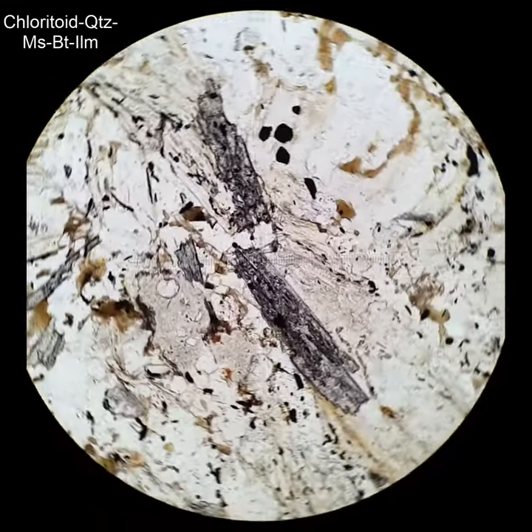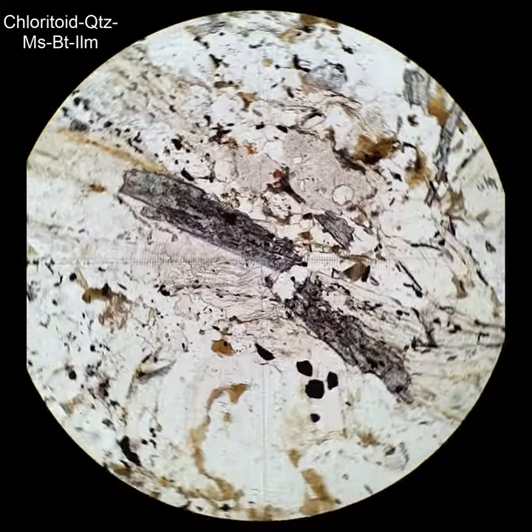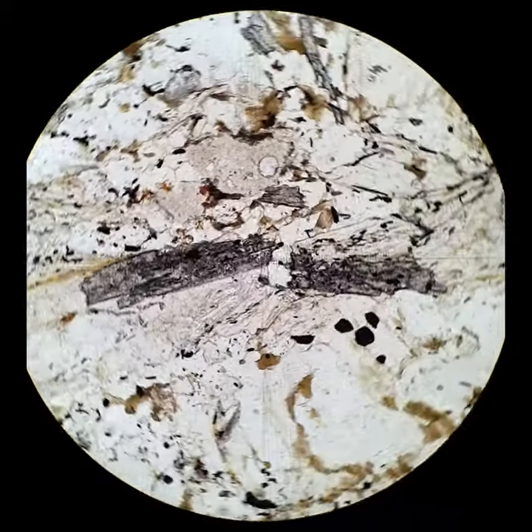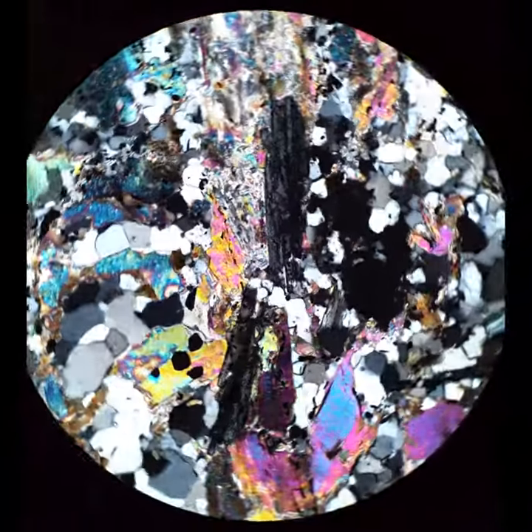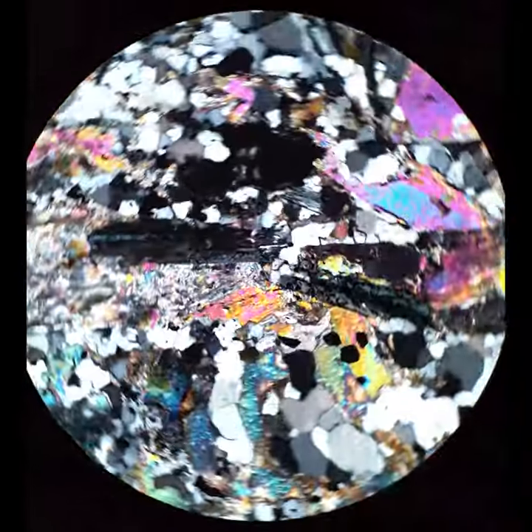A couple crystals of chloritoid, again showing that high relief and blue pleochroism, and they seem kind of cloudy because they're just filled with little quartz inclusions. When I cross the polars, you'll see that same sort of twinning, that sort of bluish interference color, and then you may see some little dots in there — those are the quartz inclusions.